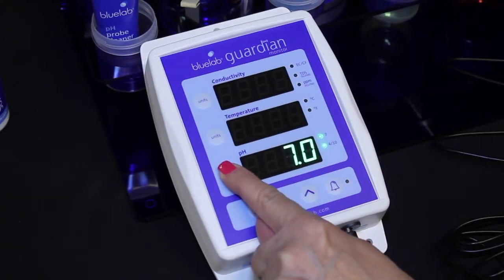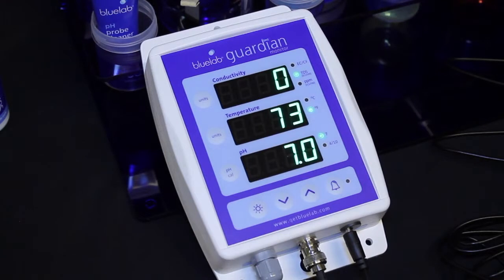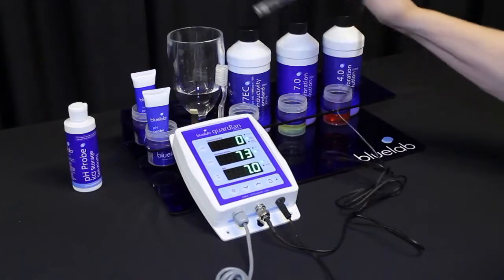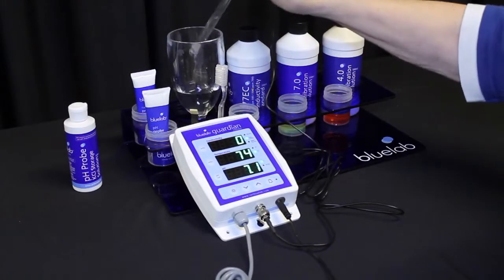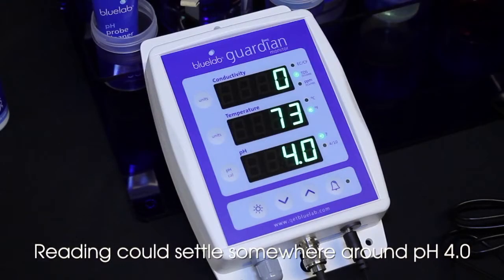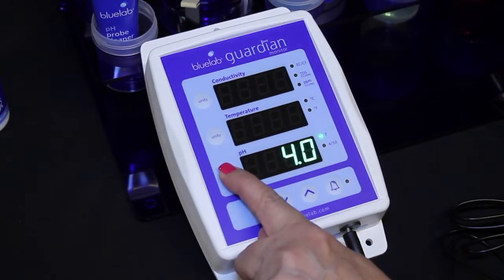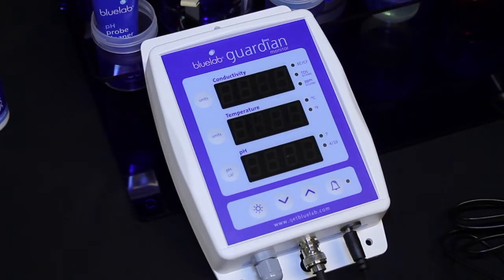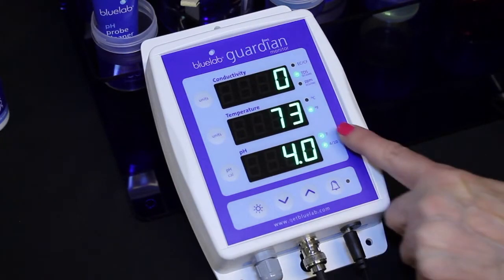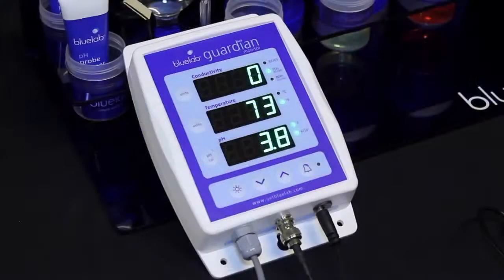Press and hold the pH cal button until the display shows pH and cal on the top two displays, then release. Seven will flash on the pH display, then the pH 7.0 indicator light will glow. Rinse the probe tip in clean tap water and place it in pH 4.0 solution. Be patient and wait for the reading to stop — it may take a few minutes. Press and hold the pH cal button until pH and cal appear, then release. Four will flash on the pH display, then the pH 4.0 indicator light will glow. Rinse the probe in clean tap water.